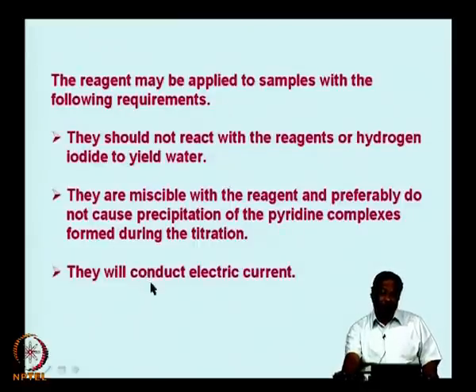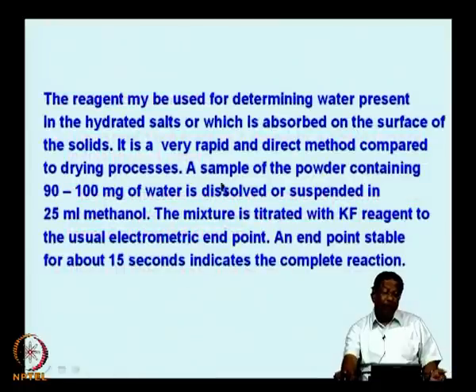And if you are conducting a potentiometric titration, then preferentially electric current should be passable. That means the solution should be fairly dilute, and easy reproducibility should be obtained. So, the reagent may be used for determining water present in the hydrated salts.